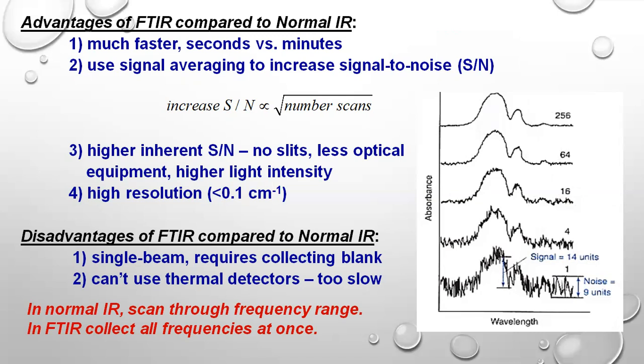Other advantage, it is time saving. Since it is based on the principle of averaging, the signal to noise ratio is always better than the conventional IR. The resolution of the spectrophotometer is higher.